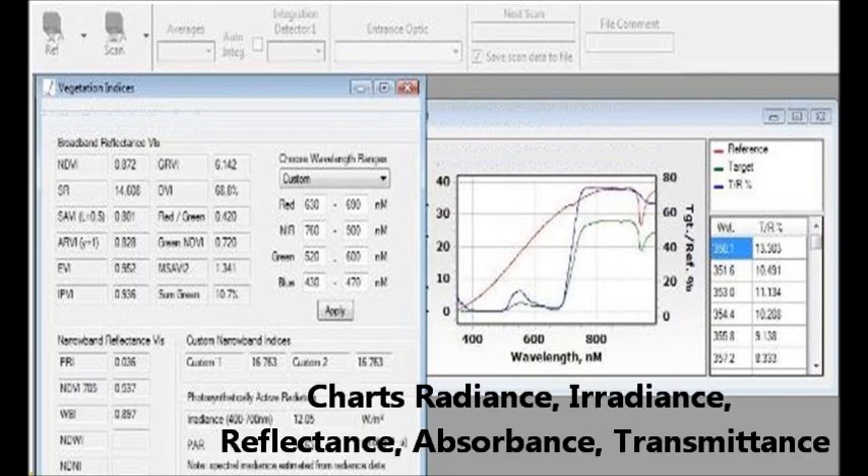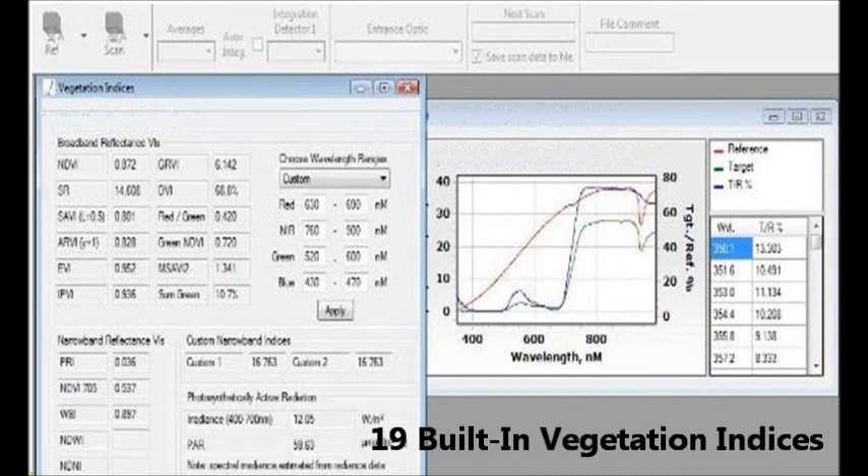You can collect radiance, irradiance, reflectance, absorbance, and transmission scan data. It also has drop-down menu access to 19 built-in vegetation indices.